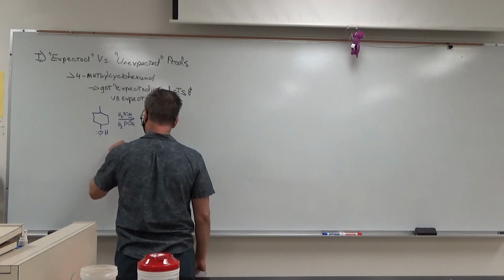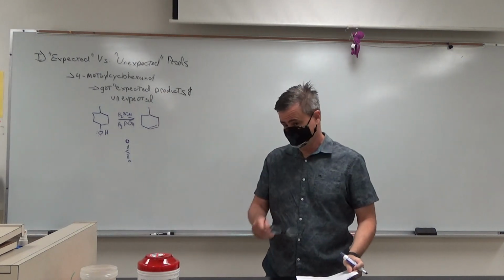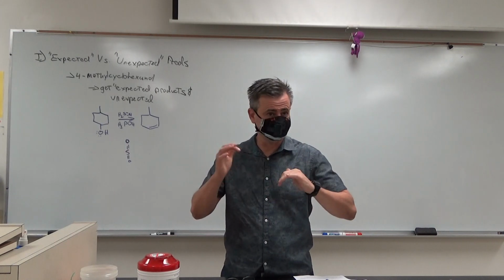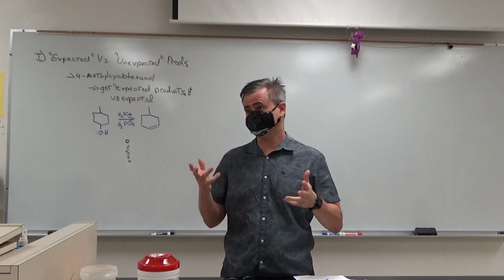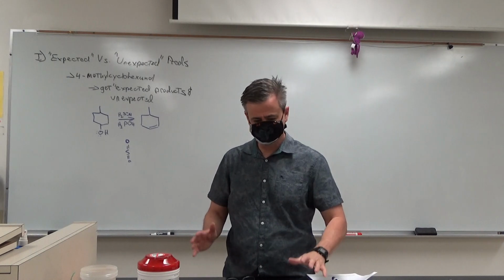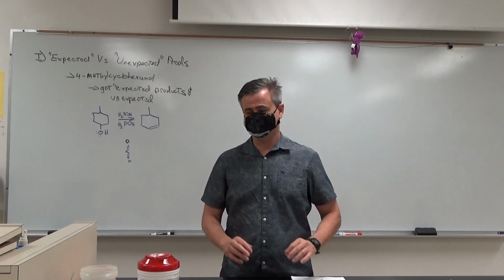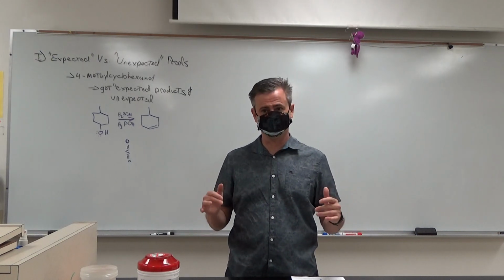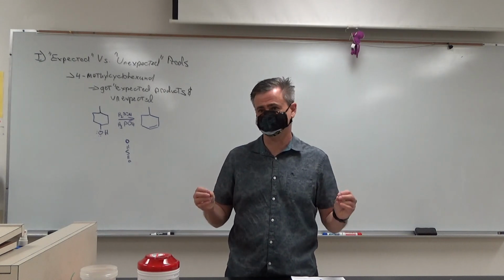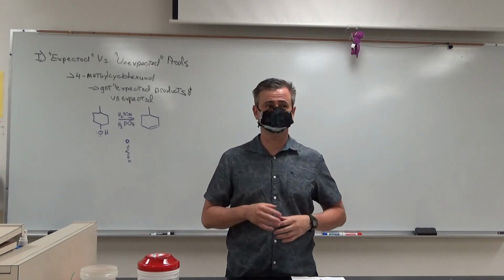And real quick, your part of the worksheet is writing mechanisms. You need to use ChemSketch to write your mechanisms. So either it's on your laptop, you go to the computer lab, or you use VMware to get into the system. Okay. I just want to, again, I hate this part because I have to insult 99% of the students, and I just don't see any way around it. This has been one of the labs where temptation has overcome occasional students. So when you make your mechanism, that's your mechanism. You've got to make your own.